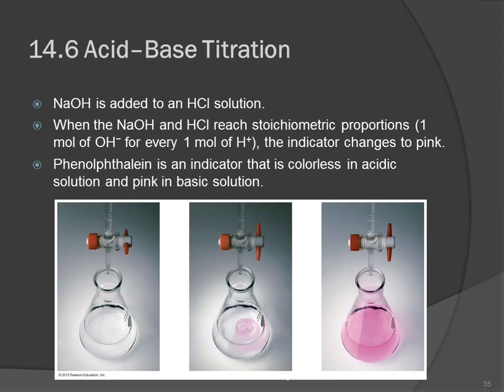But we're going to try for pale pink, blush pink, pink that lasts like 30 seconds and then slowly disappears.